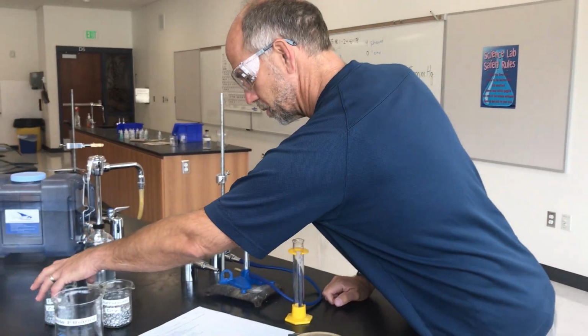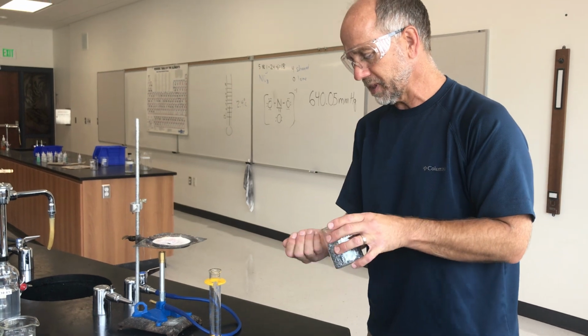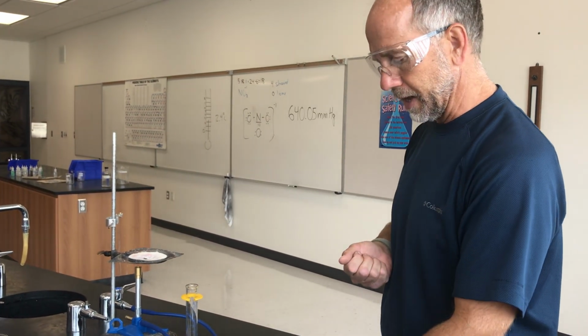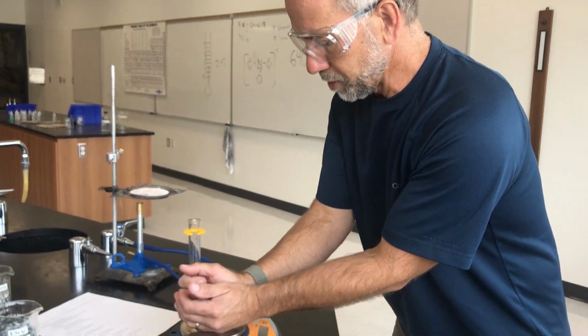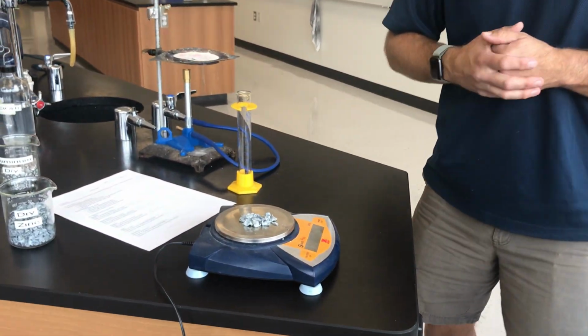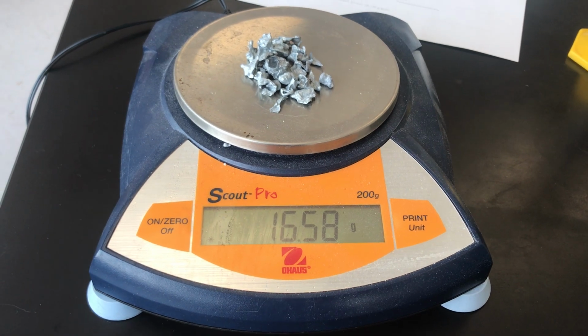The first solid that we will use is zinc. As you understand from the pre-lab conversation, we will use more than one piece of zinc. Again, large samples decrease error. And we will place these pieces of zinc on the balance. That then is the mass of our metal.